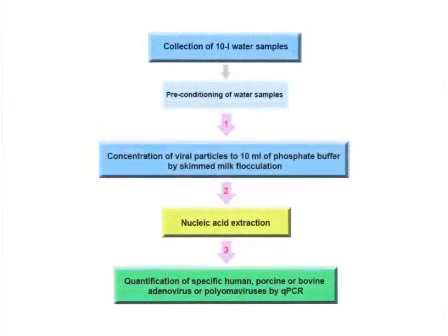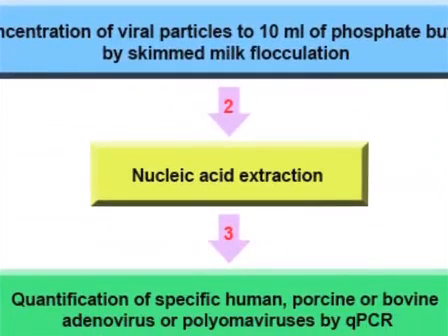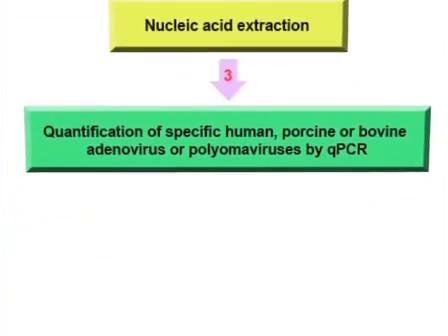We have developed a protocol for the concentration of viruses from 10-liter water samples by organic flocculation using skimmed milk, extraction of viral nucleic acids from the sediment, and quantification of human, bovine, or porcine DNA viruses using quantitative PCR.